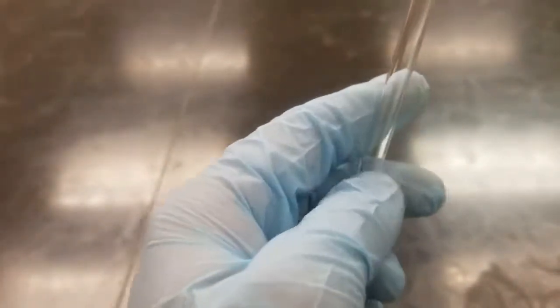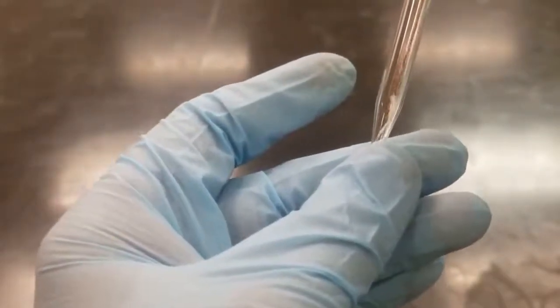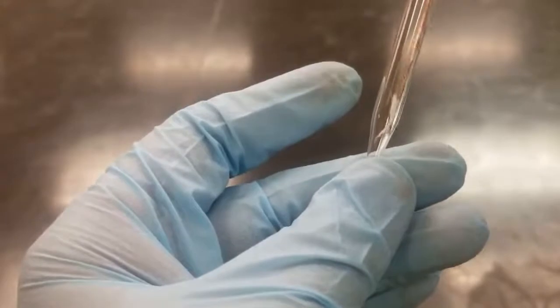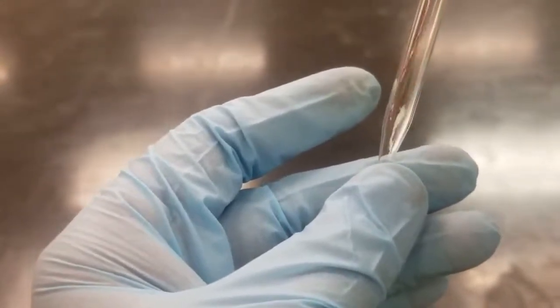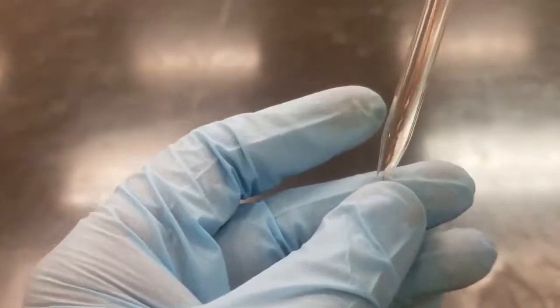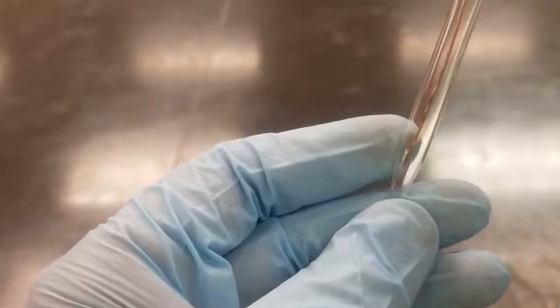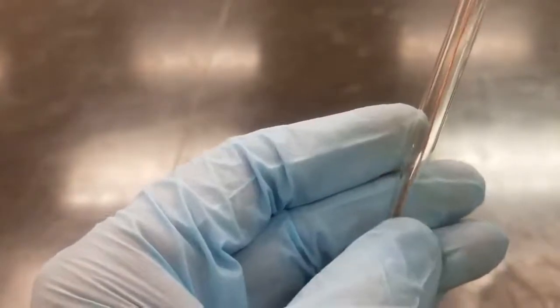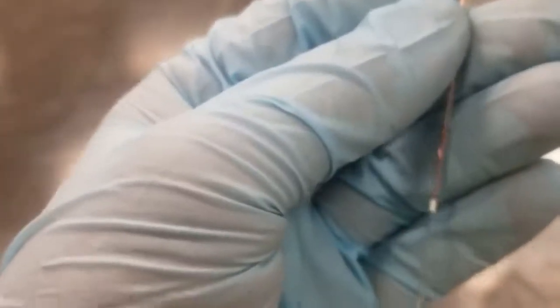And so this part's going to be really the pain part for the lab. So just try to get it any way you can to go down. There we go. And then once you've got it kind of down in there, you don't want to force it too much. Just give it little taps and just continuously push it down.